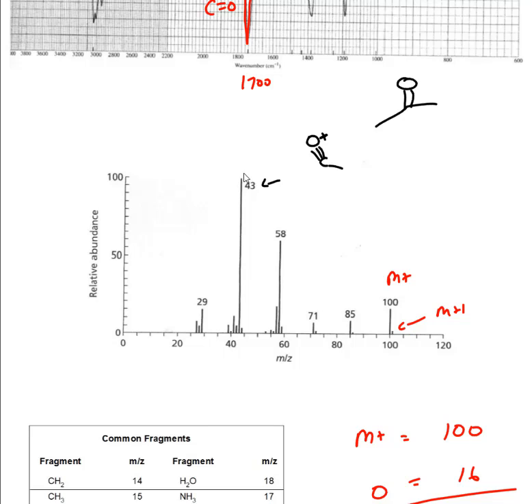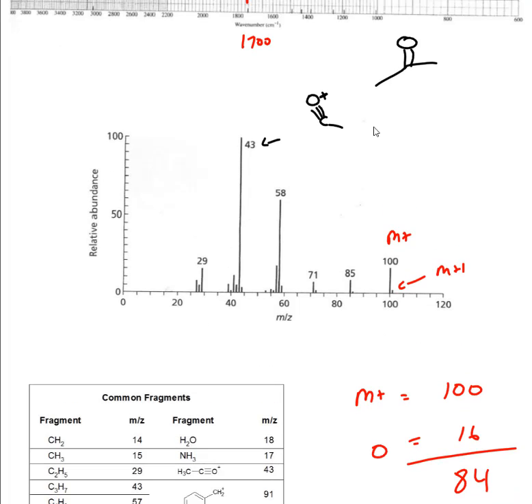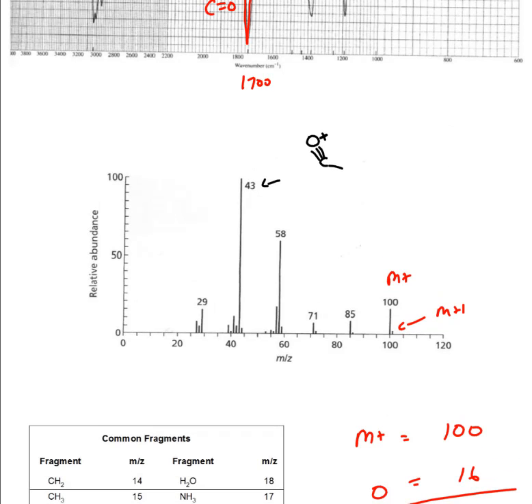So let's go ahead and figure that out by just getting the 43 in place. So here's what I mean. I know that from my fragment point of view, this is the most important fragment, right? If you go back to your notes, you can see that in your summary sheet. So what is this right here? Well, this is a 16 for oxygen and 12 for carbon, right? So that's 28. And we need to get to 43.